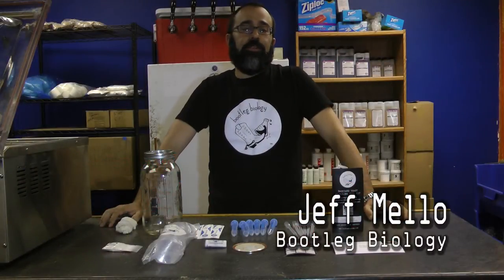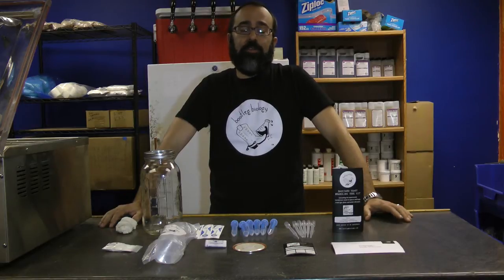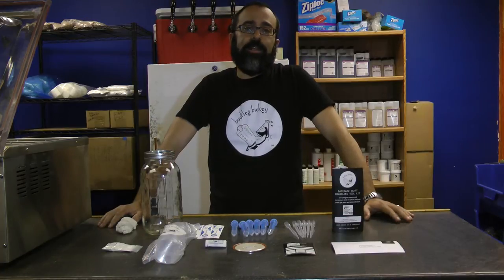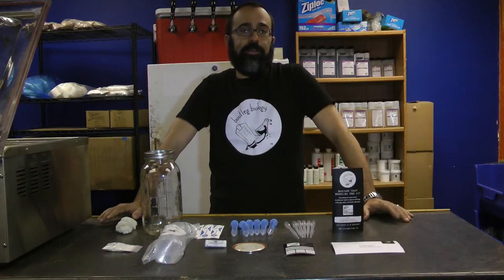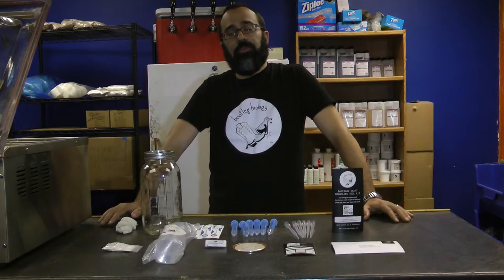I'm Jeff Mello, Chief Yeast Wrangler at Bootleg Biology. Bootleg Biology is an open source yeast project whose goal is to build the most diverse library of brewing microbes. All those microbes we're sourcing from wild sources — backyards across America, honey, fruit, anywhere we can find it. Part of that mission is teaching everyone entry-level lab techniques, things that anyone can do to isolate their own pure yeast terrain to brew with.